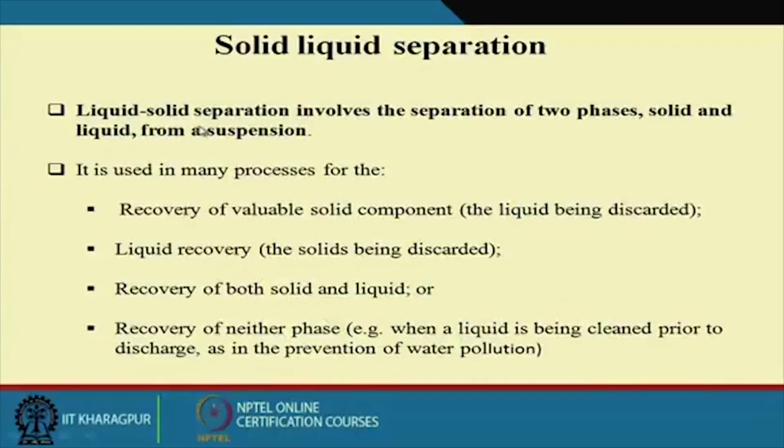First I have chosen solid-liquid separation. This is a very important aspect of downstream processing. Solid-liquid separation involves the separation of two phases, solid and liquid, from a suspension.